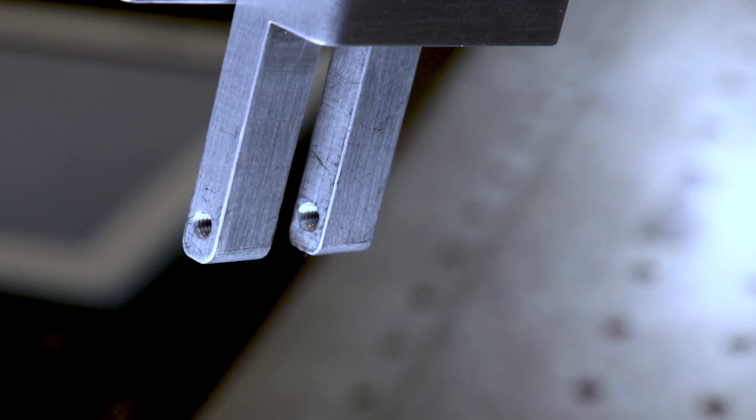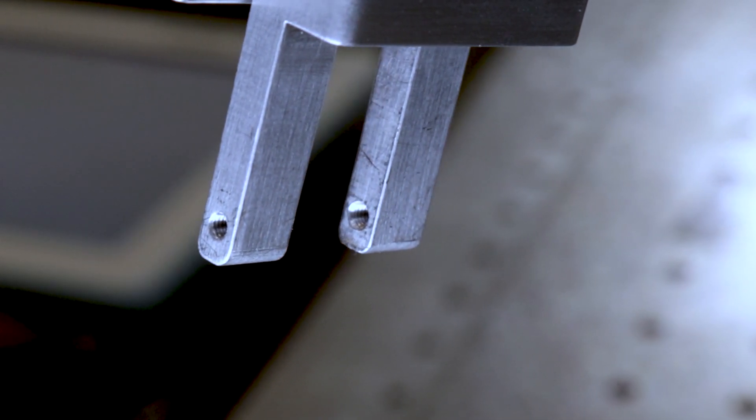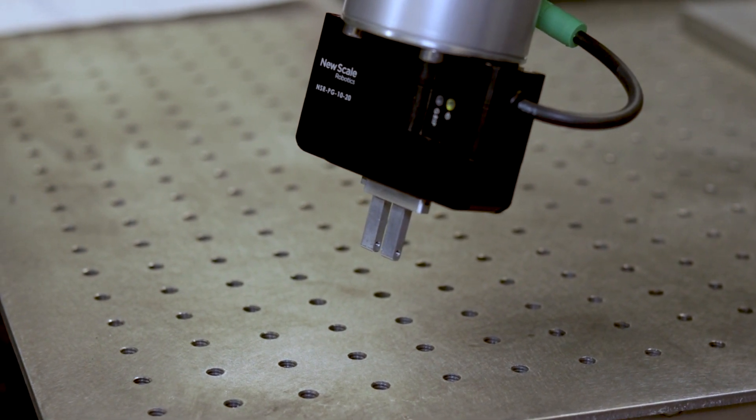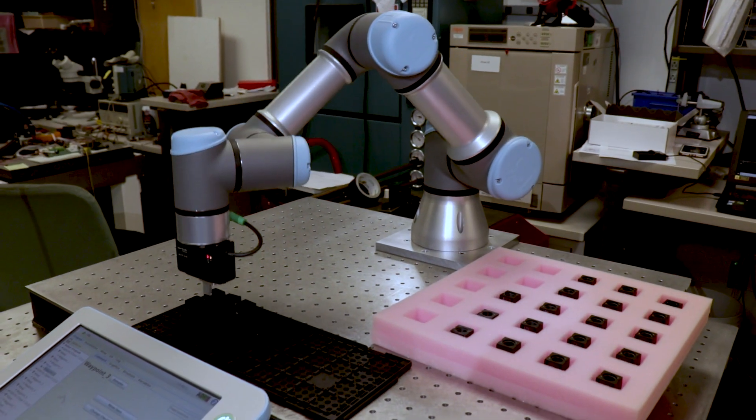The NSRPG ships with standard fingers installed. Upon request, NewScale can work with you to design a set of custom fingers that will best suit your needs.